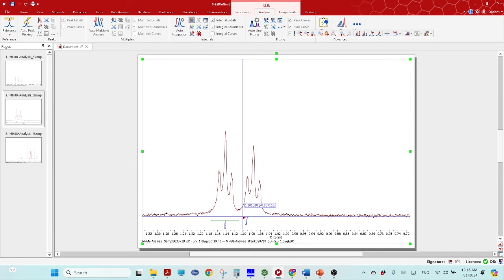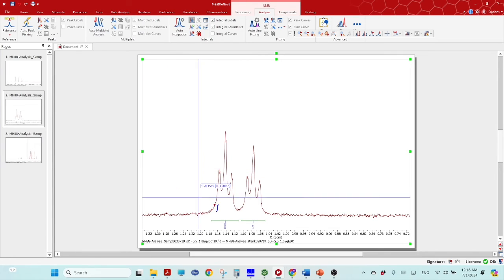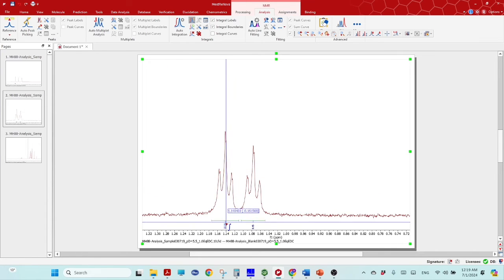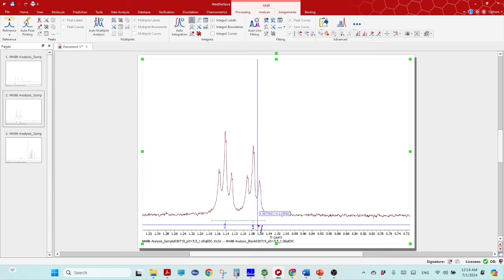So now do the integration of this peak. This is converting urea. So if you see, now the EDC remains 10 because it is 3 protons, and your DMA, like internal standard, also is for 3 protons, so it will be like 3. So whatever the p value you will get, that is the value of the concentration. So it is 10 millimolar and urea is forming 8 millimolar.